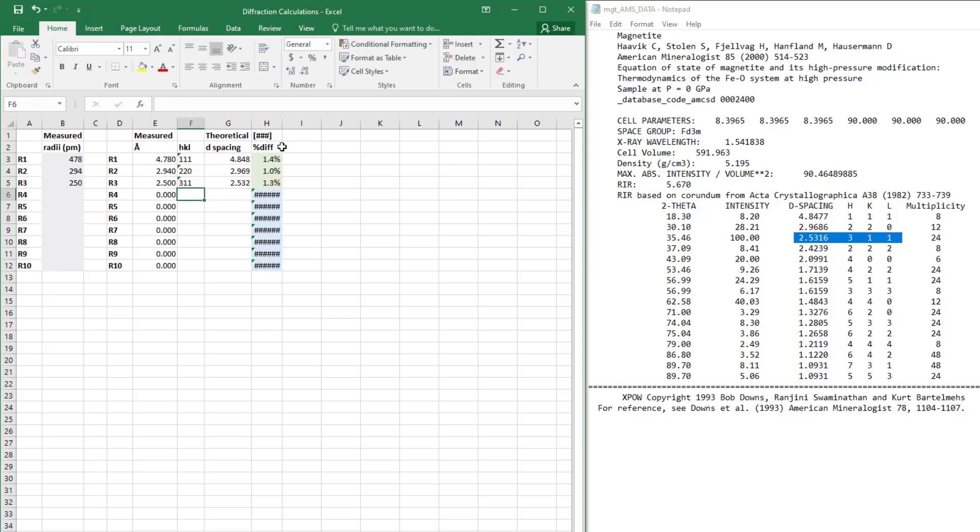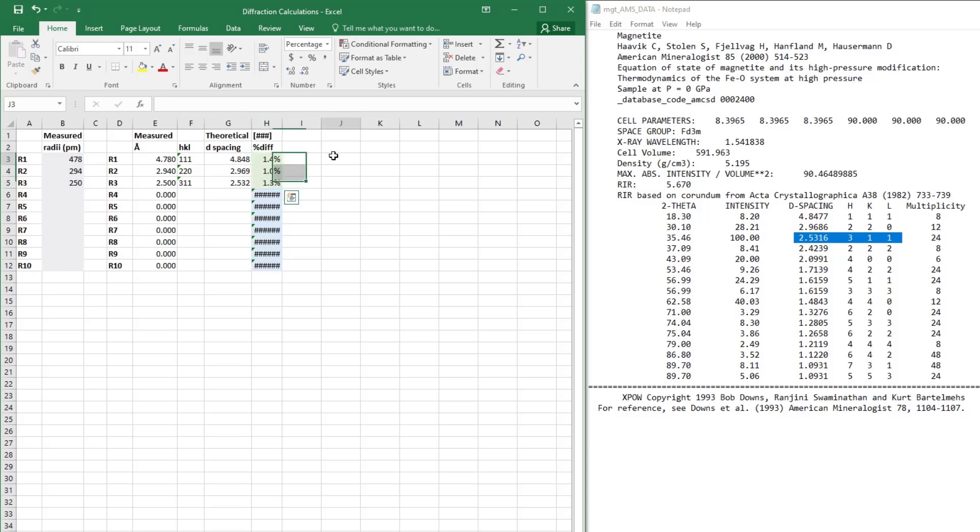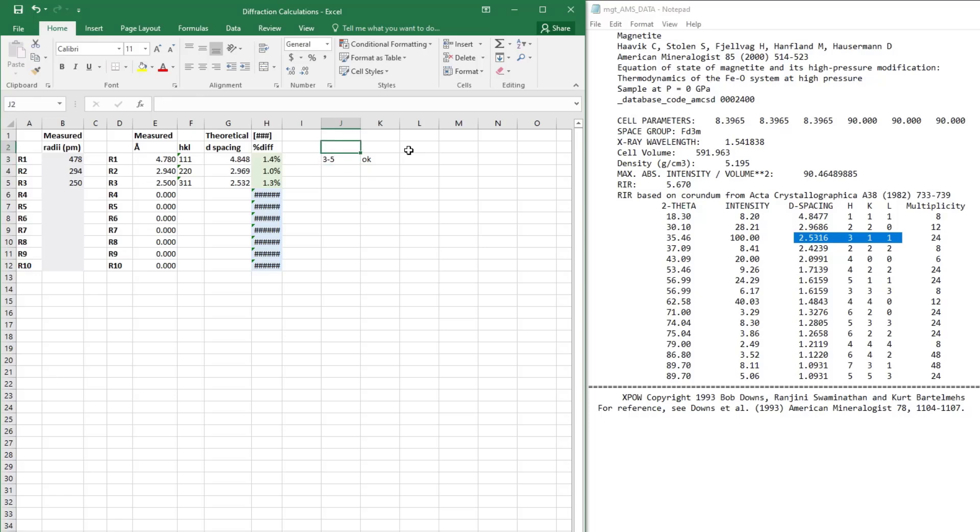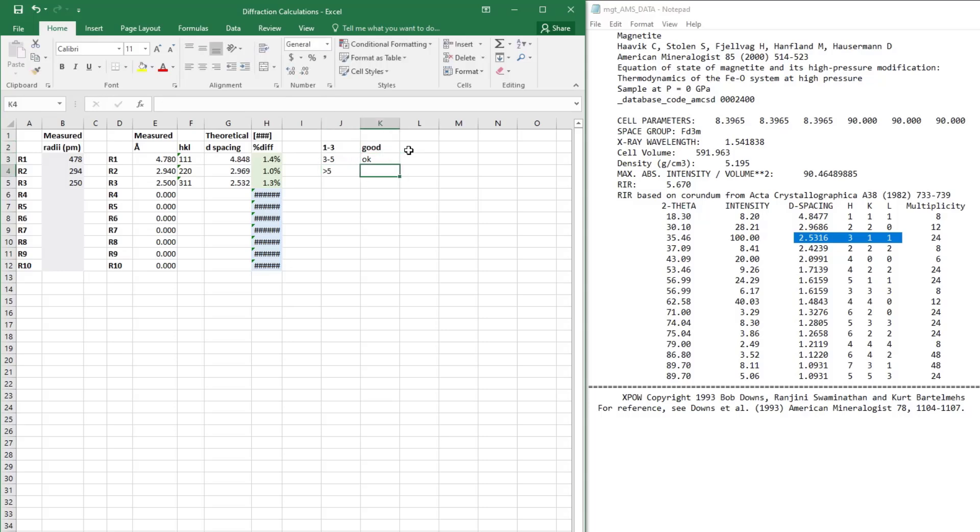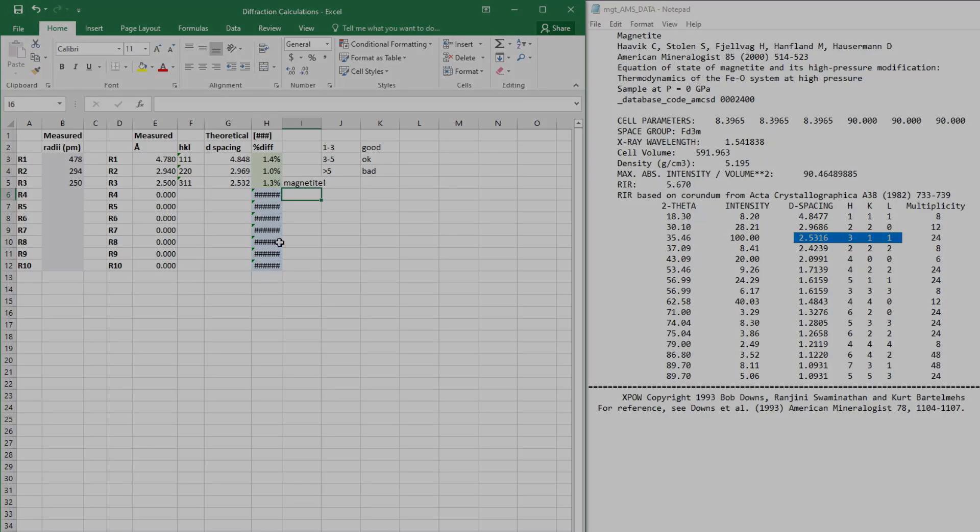So these are all really good matches. How do I know what good is? Well, it depends. Personally, my rule is that if something is from 3 to 5 percent difference, that's an okay match. From 1 to 3 or less than 1 even is a good match. Anything above 5 percent difference, I start to question whether that's actually my mineral phase. So in this case, this is a good match to magnetite, so we've determined what our mineral phase is.